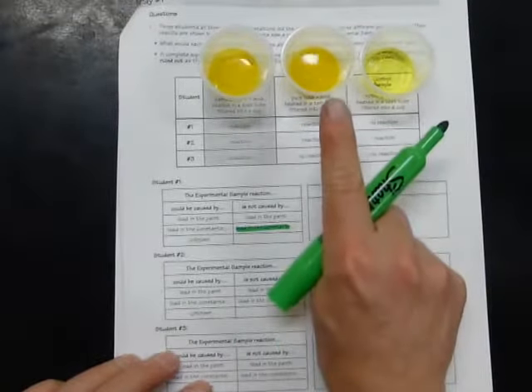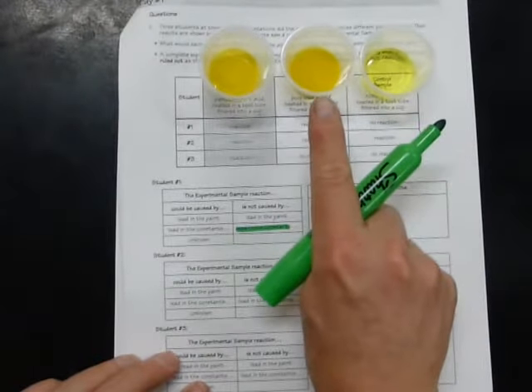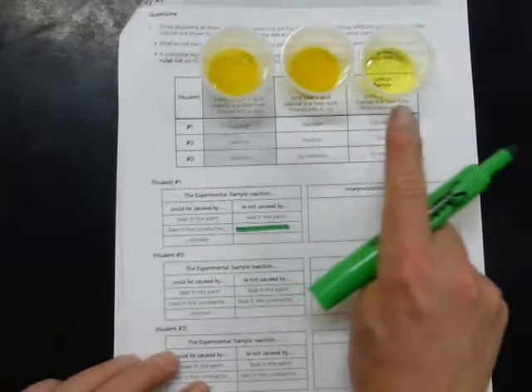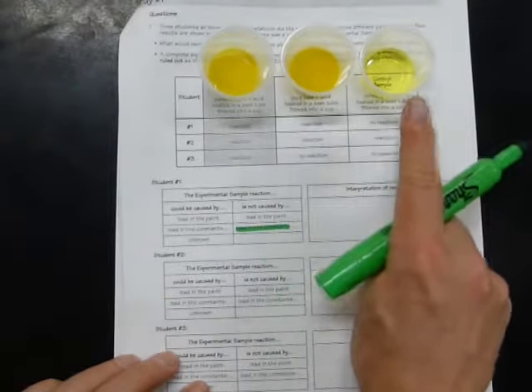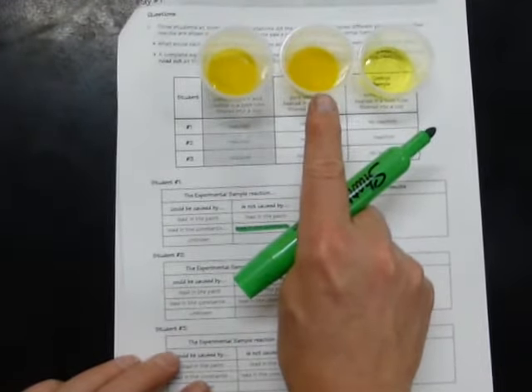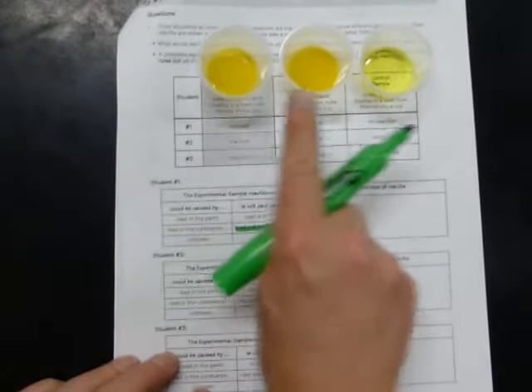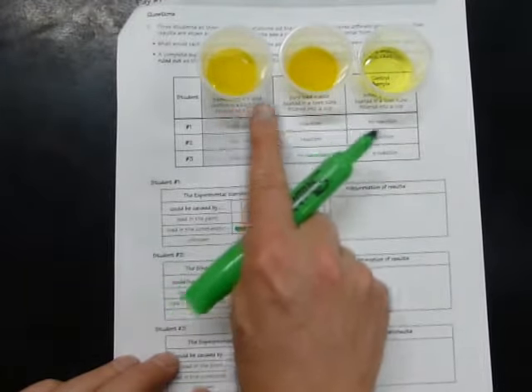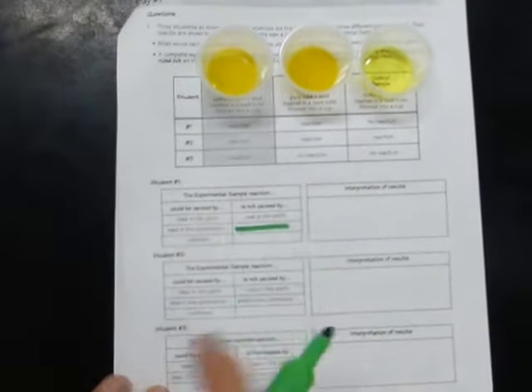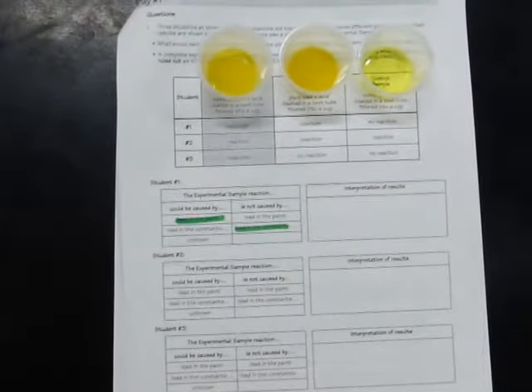And I know from the standard that there's a reaction when there's lead present. The only difference between the standard and the control, since they have the same cups and acid and tubes and filters, is that this one had lead added to it. So this reaction here must be explained by the thing that's different, that there's lead. So when I see that the paint reacts just like the lead does, I could conclude that the experimental sample reaction is caused by lead in the paint. It's not caused by lead in the constants.